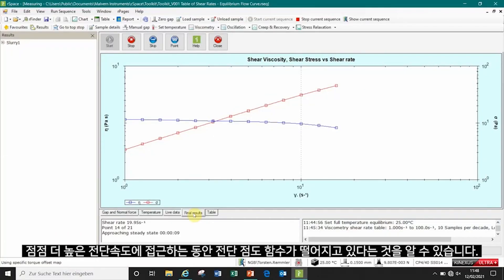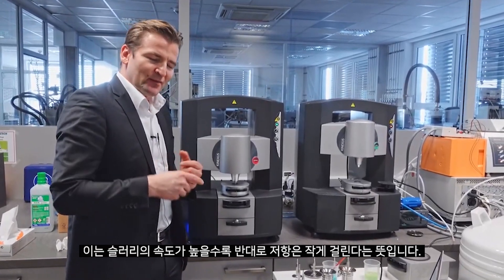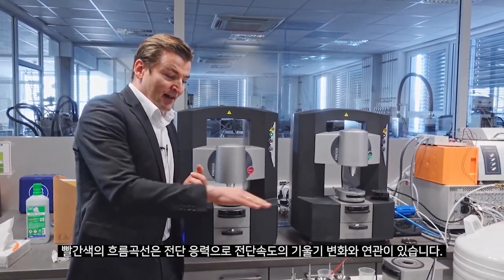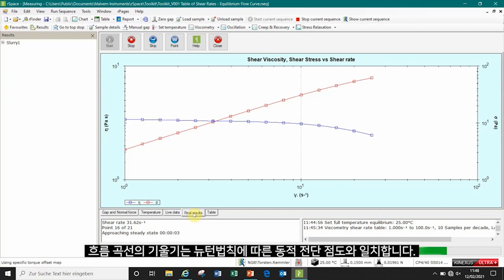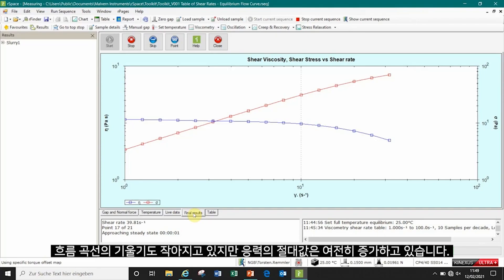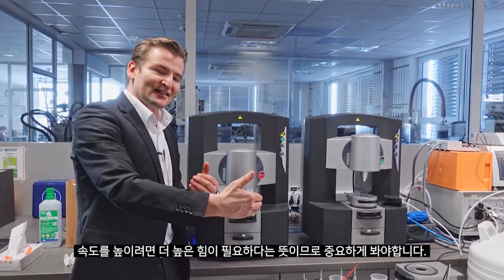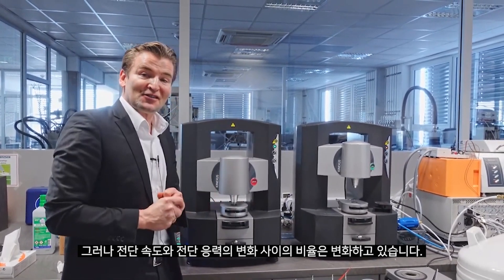As we approach higher and higher shear rates, you see the shear viscosity function dropping — a decrease in shear viscosity with increasing shear rate. That's called shear thinning: the larger the speed of the slurry, the smaller the resistance against that speed. The flow curve shown in red, which is shear stress versus shear rate, is changing its slope. The slope of the flow curve is exactly the dynamic shear viscosity according to Newton's law, and as the viscosity drops, the slope gets smaller. However, the absolute value of the stress is still increasing — to increase the speed you still need higher forces — but the ratio between the change in shear rate and the change in shear stress is changing.